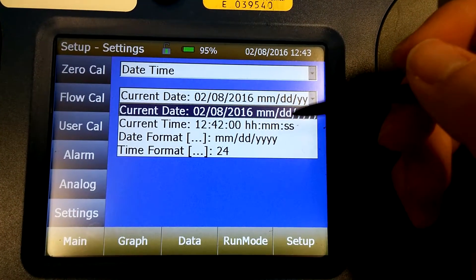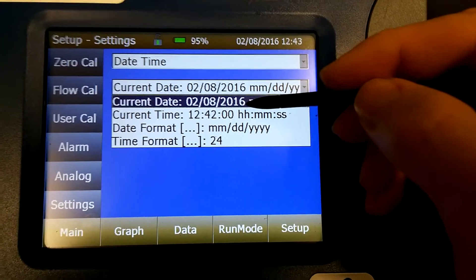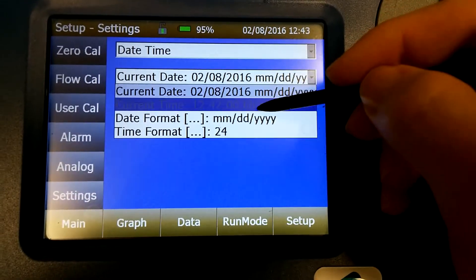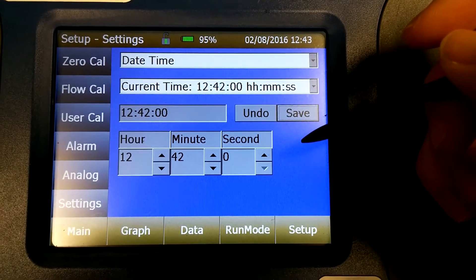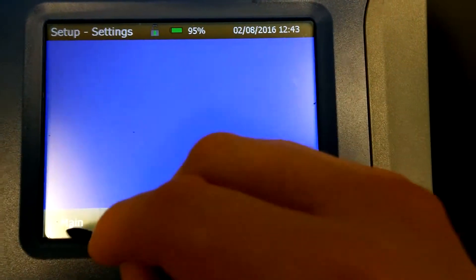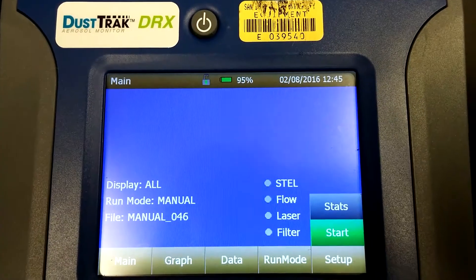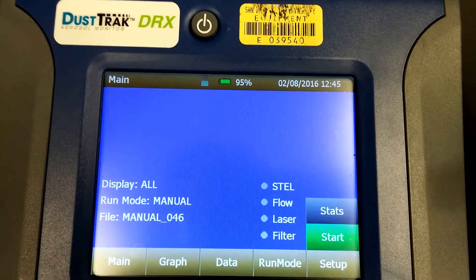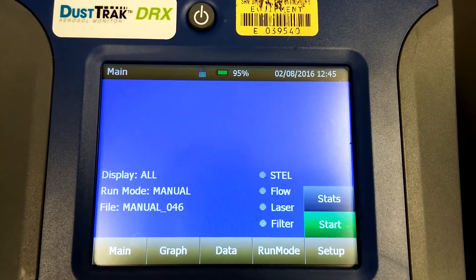That is how you set the date and time. It's very important to have the correct time — even if you had the wrong date, that's fairly easy to remedy, but if you have the wrong time, that can really muddle things up and become a real hassle. Make sure your time is correct and synced. After you set the time, always verify it against your master clock — wait until the following minute starts and make sure it switches over at the same time as your master clock.